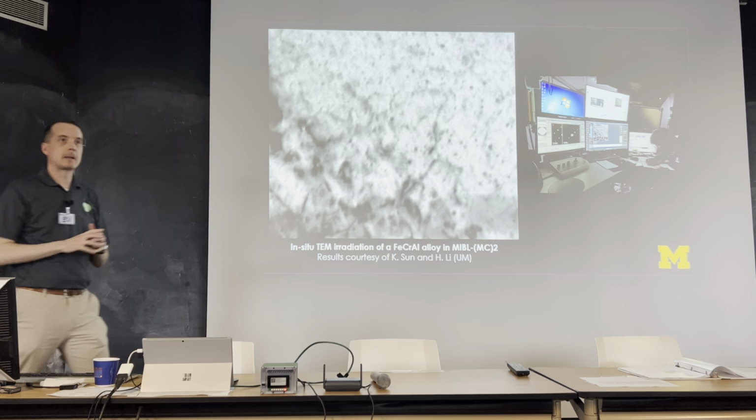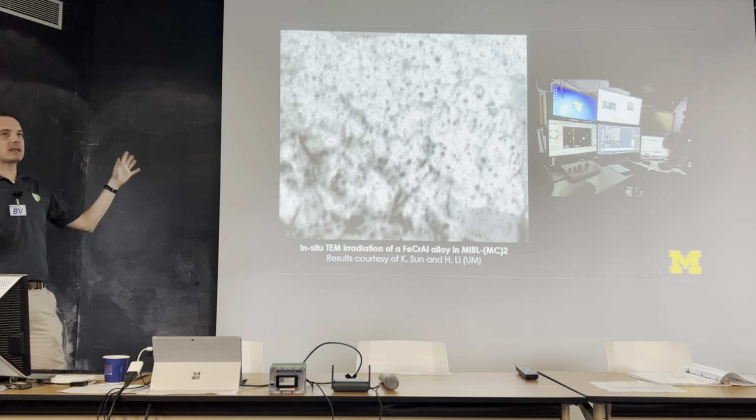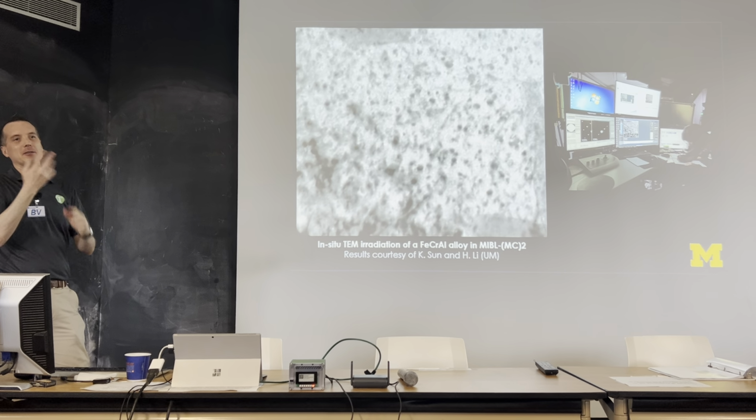Yes? What was the frame rate? So that one was actually a time-lapse video where they took an image basically once a minute, and then they compressed it all down to 2 minutes.